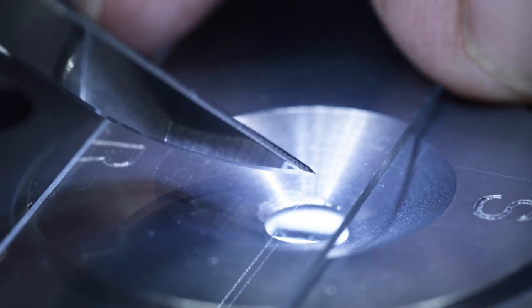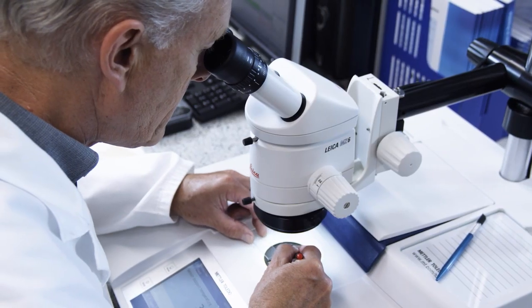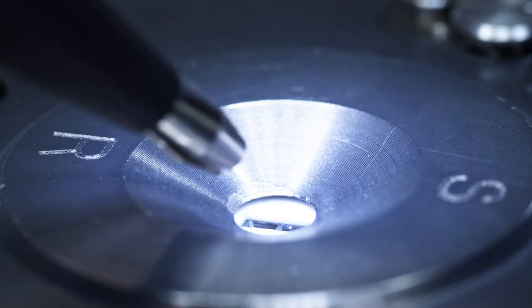The ergonomic design of the instrument, the touch screen display and the microscope ensure complete ease of use when working with such very small samples.